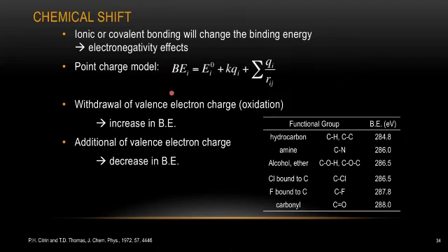So earlier I mentioned we can use the XPS data to determine different stoichiometry information for oxide materials, and that all depends on the chemical shift. Because each photoelectron peak should always sit at the same binding energy. So by ruling out any potential charging issue, any remaining peak shifting of your signal will simply rely on the ionic or covalent bonding, also known as the electronegativity effect.